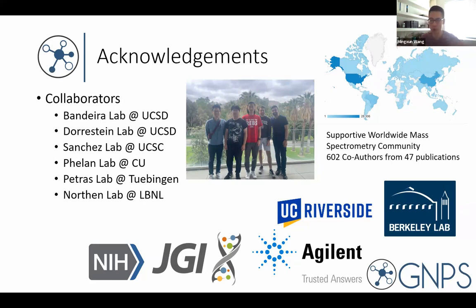And so one of the things that we can do on the GNPS2 side, especially with MassQL, is we can start visualizing entire molecular networks in the browser, which is not the fanciest thing, but it is convenient. We've also integrated that particular functionality with MassQL directly. Earlier today, you created molecular networks, but you have to download those in Cytoscape, which is a really powerful piece of software, but it doesn't really know about mass spectrometry data. So we've enabled this in the browser, so you can apply MassQL on top of a molecular network, and then it'll highlight everything, and then you can download that table and work with it. If you work with it in Excel or anything like that, totally possible.